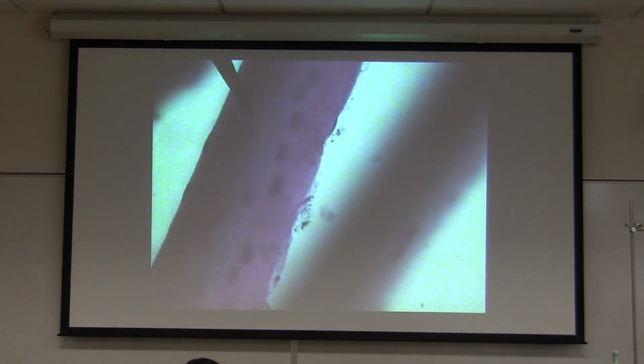Skeletal muscle. Why? I don't see any striation, but you see many nuclei on the periphery of the cell. The only thing it looks like is skeletal muscle. Now you see some striation, and the nuclei on the periphery. So this is skeletal muscle at high magnification.